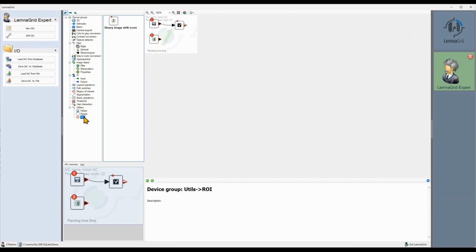Almost all devices have input and output ports to connect them to other devices. Only so-called reader devices have only outputs. These devices read data from a given source. There are special reader devices supporting a legacy database system. Their names start with DB. You can safely ignore them. They have no use with a modern database system. One of the devices from the minimal start analysis belongs to these devices, hence we can remove it.